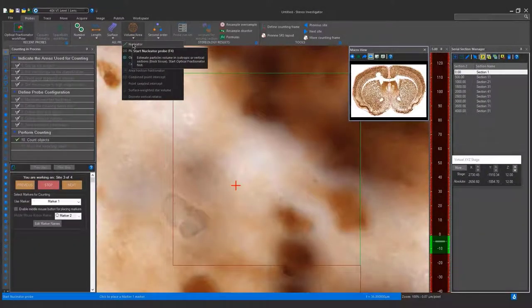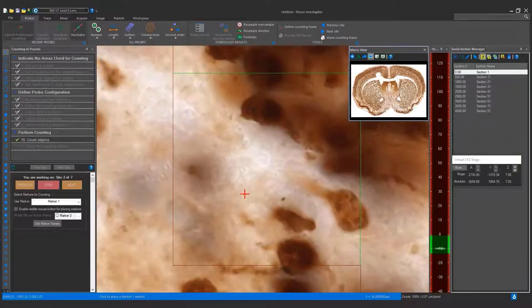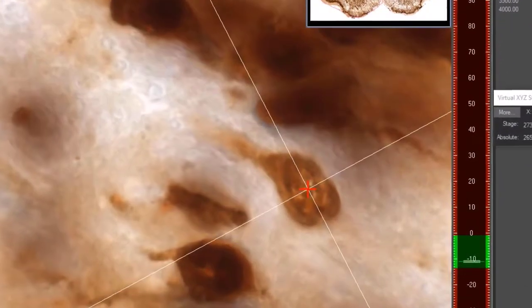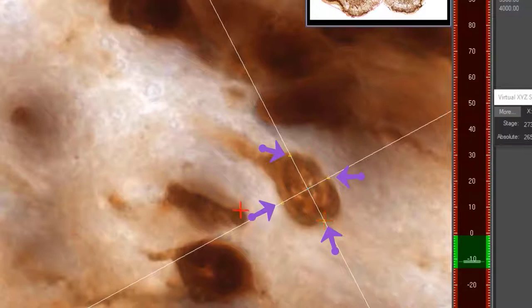Here, you can see that we have identified a cell. We are going to scroll through until we find the middle of the cell. After the click, we make markings and then right click to finish the Nucleator probe.